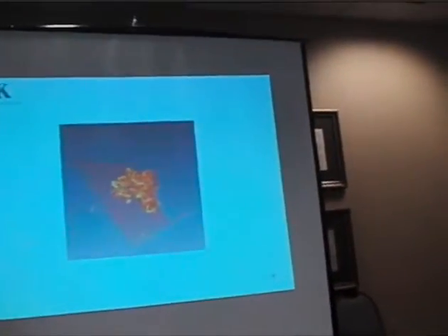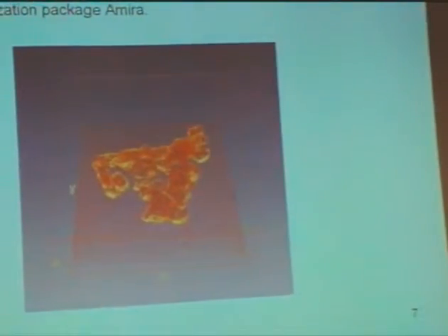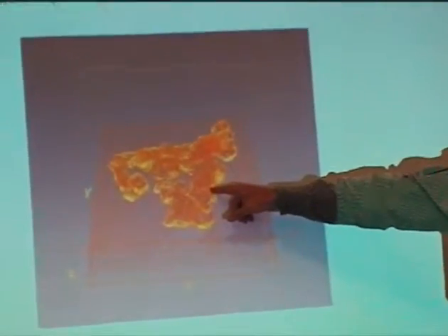Okay. And so these have been visualized by their package, and here's a different series of rotations of this particular sample, and this is the one we built. We're actually halfway through this process to try to demo it for ourselves. What we've done now is we've been able to manufacture a solid that looks just like this, but much bigger, so we can see it. We've also taken a picture of another material. Surprisingly, it's a carbon nanotube, and we would like to image that as well. And for example, here is the.